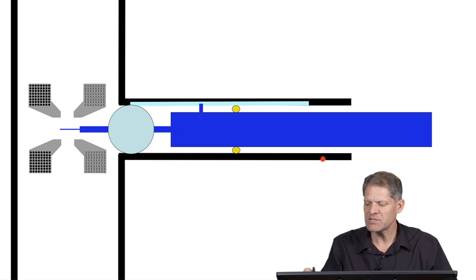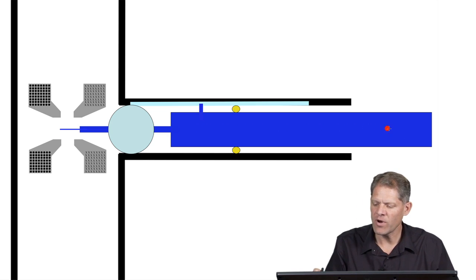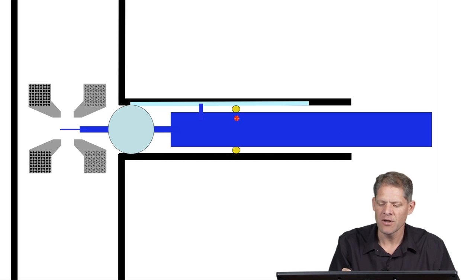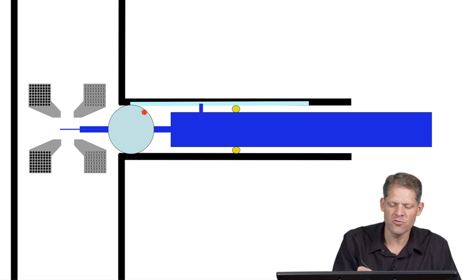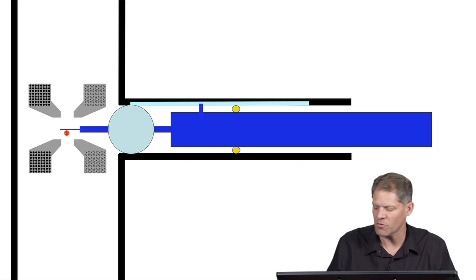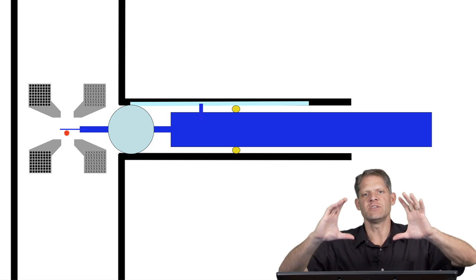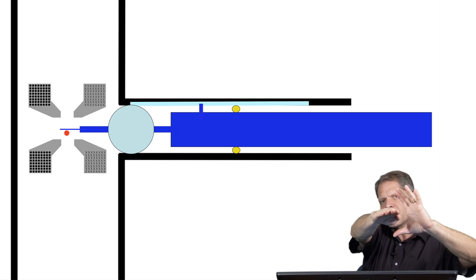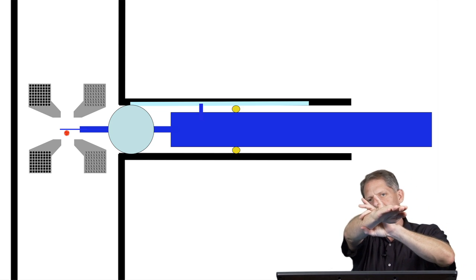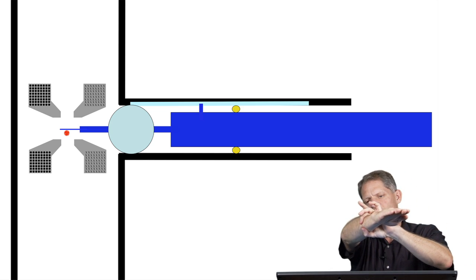Now the specimen holder itself rests within the goniometer. It's supported by an O-ring here. This is an O-ring around the specimen holder. And then the specimen holder goes through a ball valve that allows it access to the high vacuum of the microscope column. So the situation is that we have the goniometer as a tube, and then we have the specimen holder that inserts within that, and it's supported by this O-ring.